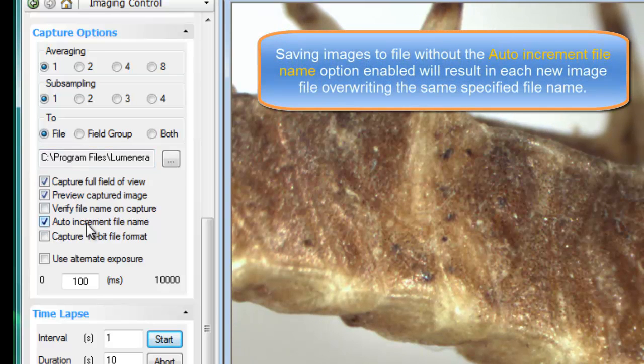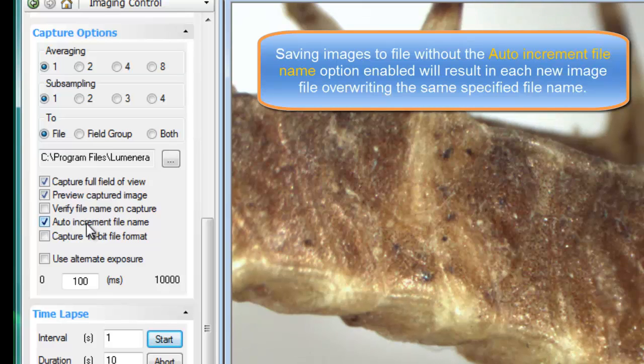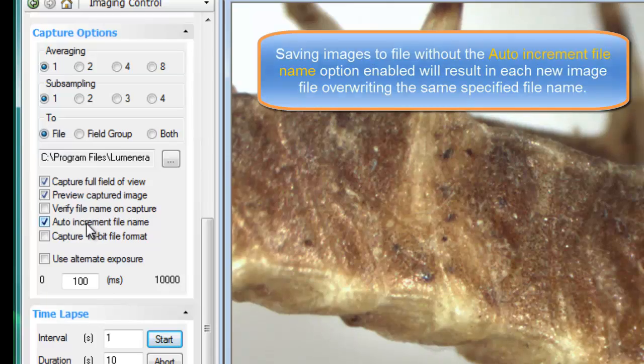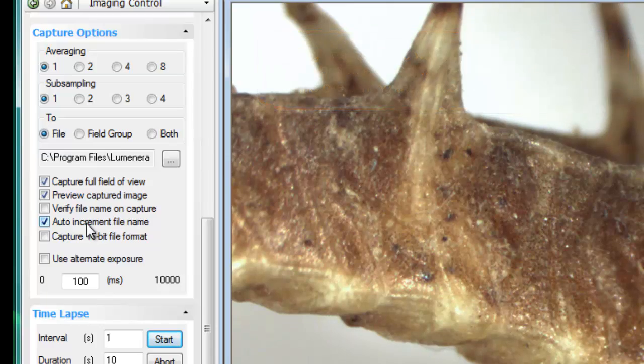However, if you select auto-increment file name, then each image that you capture will get a sequentially numbered file name updated.